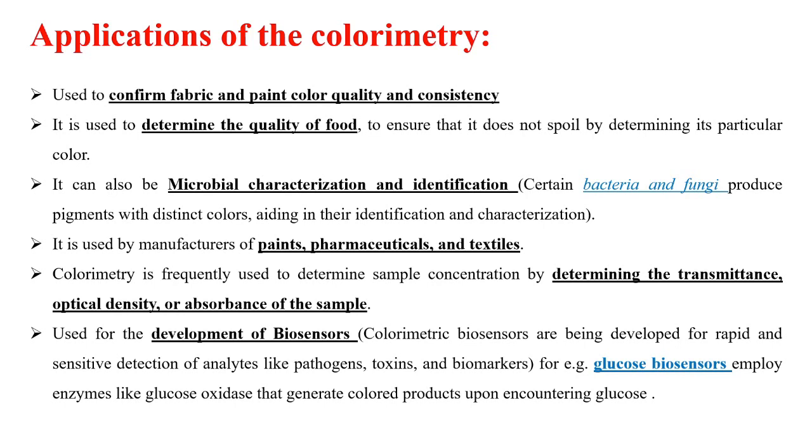You can write it down because you have to mention it in your record book. It will give you the color information in the 4 color spaces that I have discussed: RGB, HSI, CMY, and CIE lab color space. Repeating: RGB color space, CMY color space, HSI color space, and CIE LAB color space.